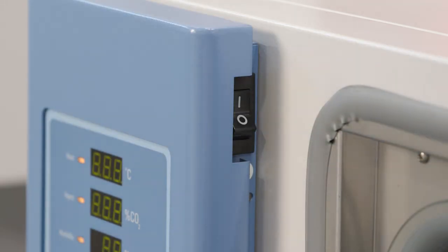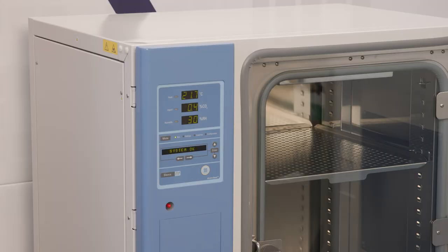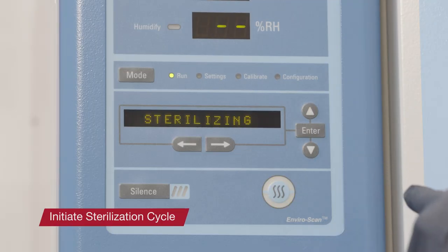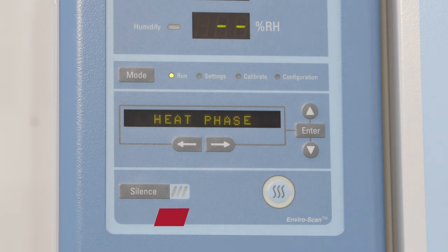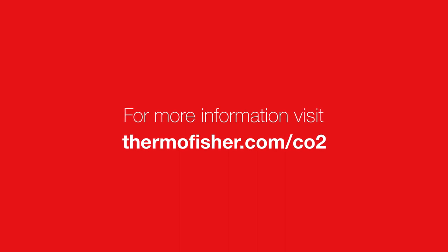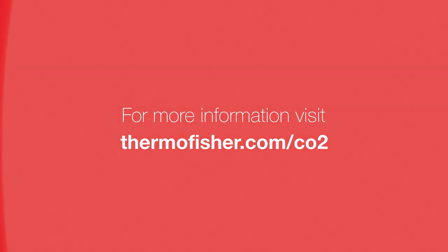For example, use a wipe test or swab test following the procedure to document effectiveness of the process. When complete, switch on the power. If desired, initiate the 140-degree Celsius sterilization cycle at this time. Refer to the user manual for more information, including steps to take before operating the sterilization cycle, such as removal of the in-chamber HEPA filter and the sensors. Thank you for your interest in proper cleaning and disinfection of Stericult CO2 incubators. We hope this information is helpful, and we wish you success in your process.